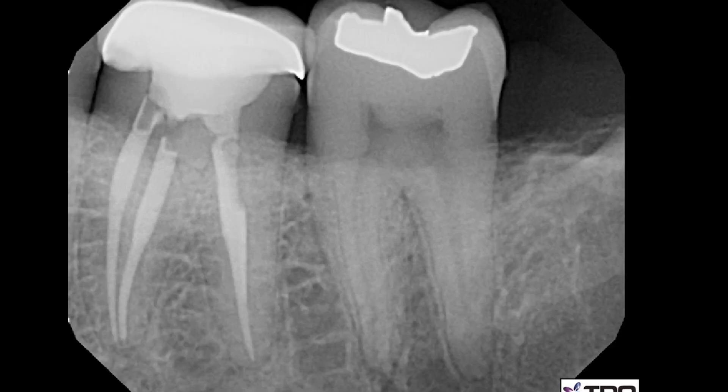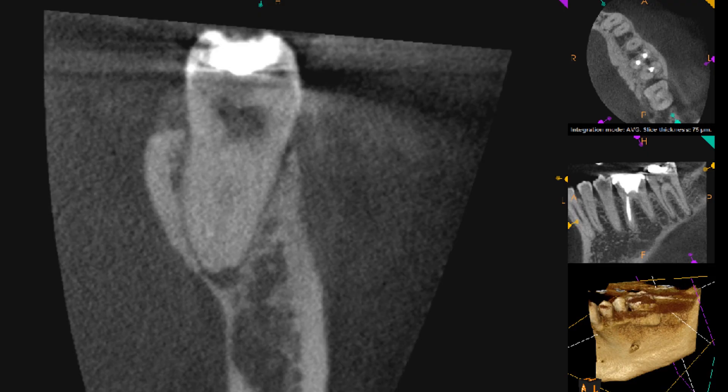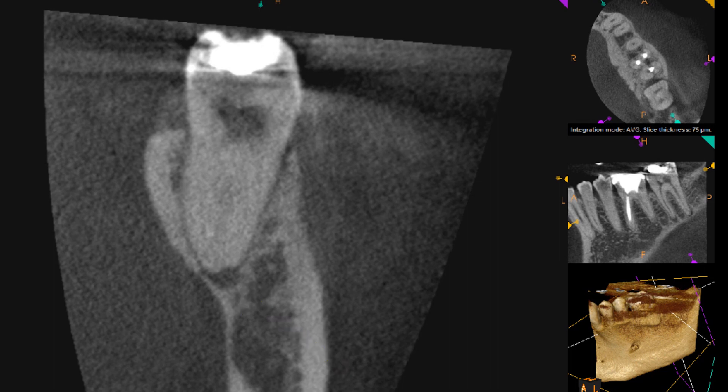This will be an in vivo evaluation of a GentleWave case done on a tooth that had a GentleWave procedure performed because of a fracture in a crown. The tooth was then extracted right after the GentleWave procedure. It was a necrotic tooth, as seen in the cone beam.